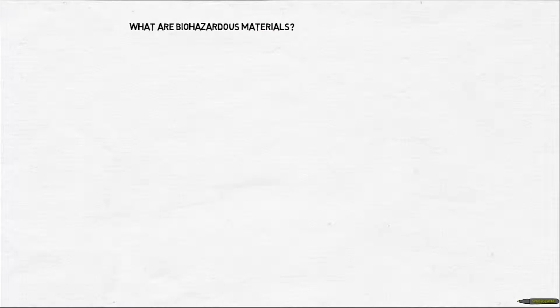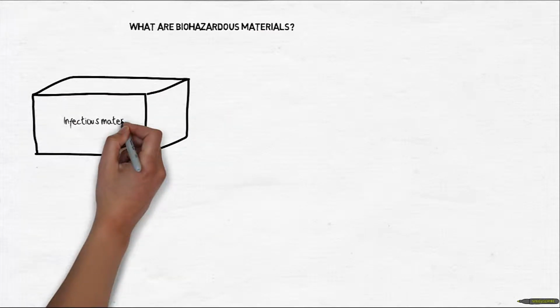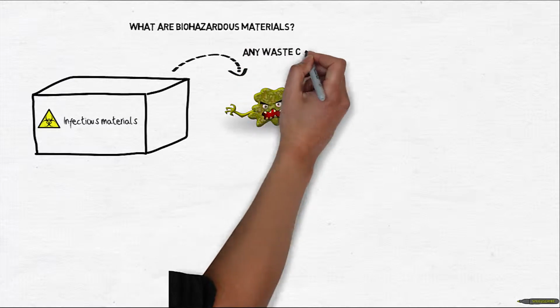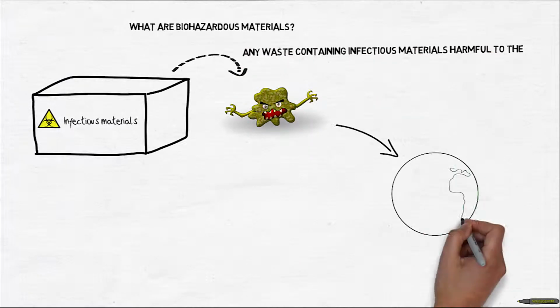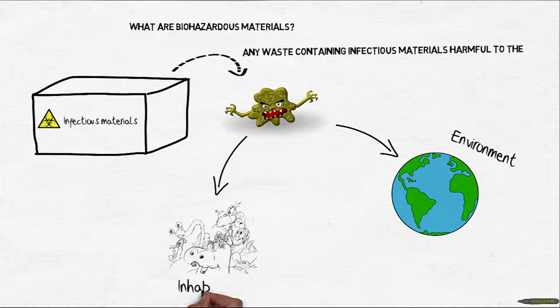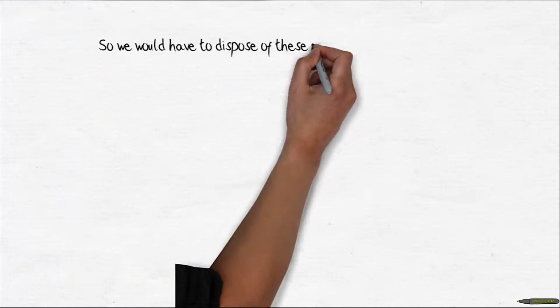What do we mean by biohazardous waste? Well, it's any waste that contains infectious materials. These infectious materials, be they bacteria, viruses, or contaminants in general, have the potential to harm the environment and its inhabitants. So we would have to dispose of these materials properly.